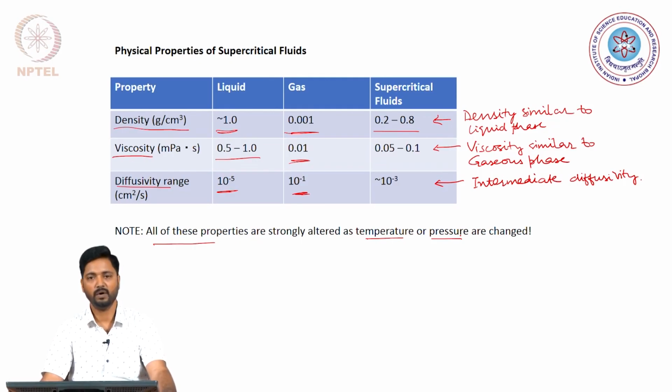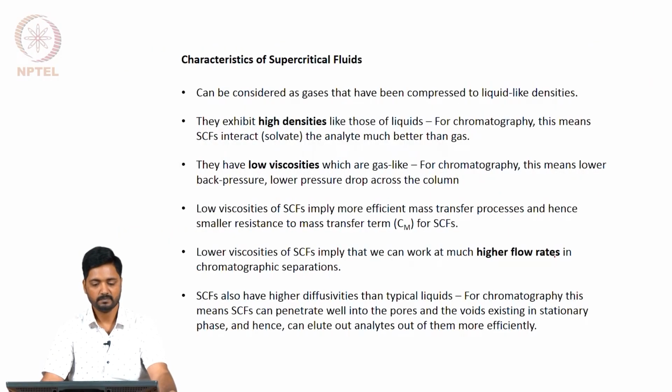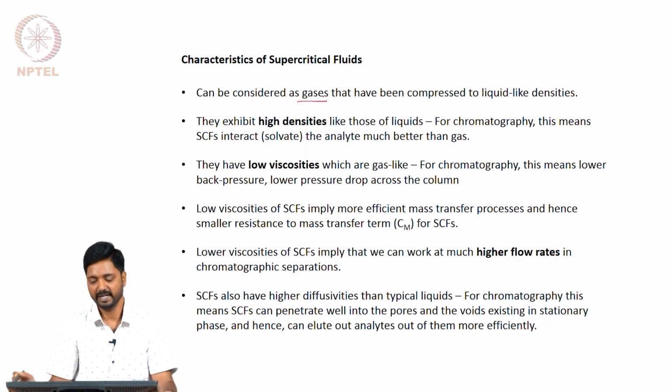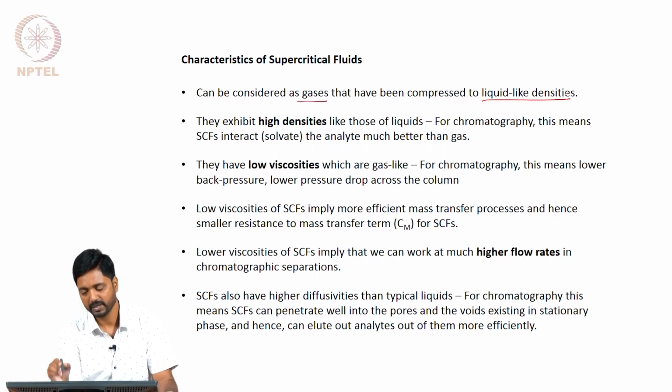So, we require to maintain the temperature and the pressure very carefully to keep our supercritical fluid in its optimum performance regime. So, what are the characteristics of the supercritical fluids? They can be considered as gases, but gases that have been compressed to liquid like densities.